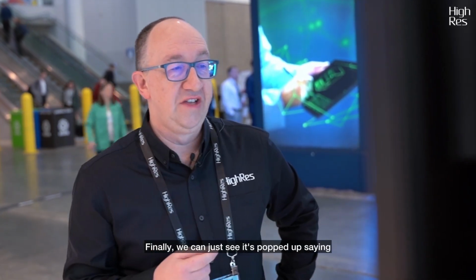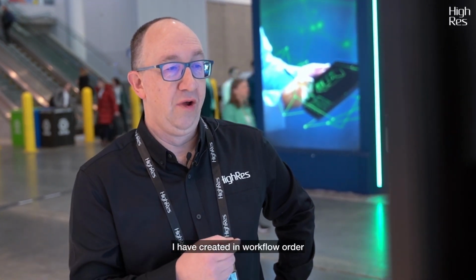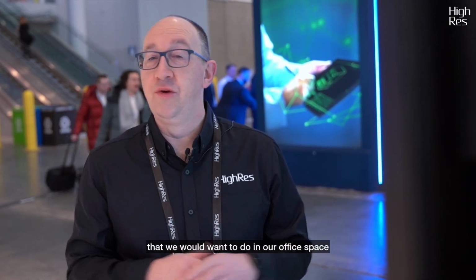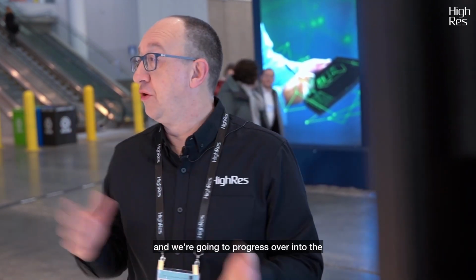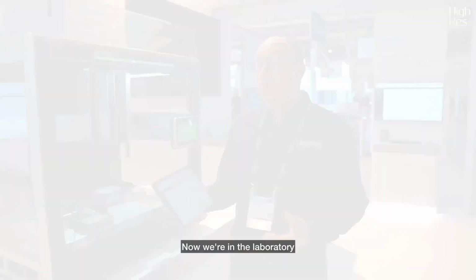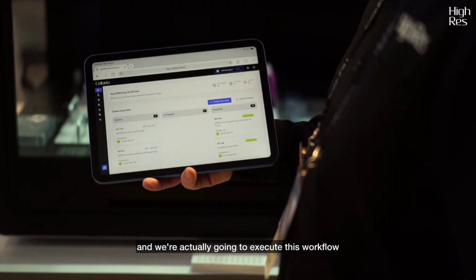So here, finally, we can see it's popped up saying, I have created a workflow order. This is called qPCR demo Rust with a date stamp, which is what I asked it to do. Now we have done everything that we would want to do in our office space, and we're going to progress over into the lab to carry on with that demo in the physical space. Now we're in the laboratory, and we're actually going to execute this workflow.